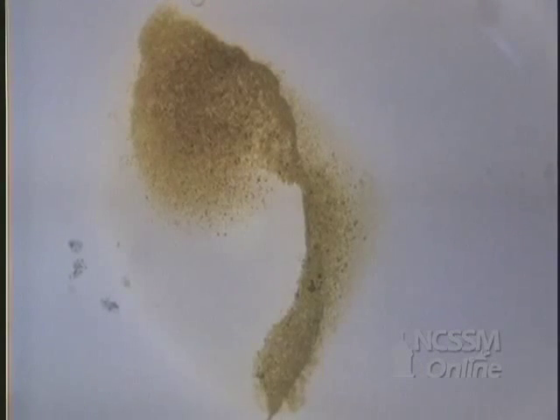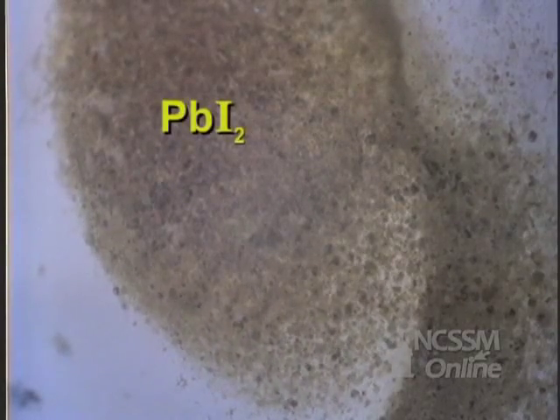The crystals are moved into the water. The compounds quickly dissolve and diffuse towards each other. They react to form lead iodide, which is a shiny yellow solid.